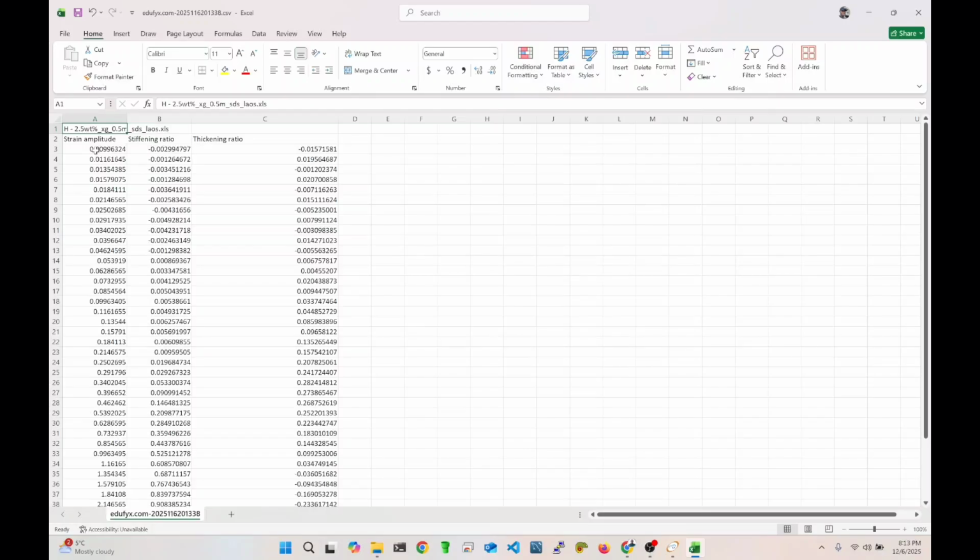So stress filtering is good in the smaller strain, in the smaller amplitude oscillatory shear regime, the SAOS regime, when the strain amplitude is small. But when the strain amplitude is large, stress filtering might result in loss of some data. So what you can do is to retain data within the small strain amplitude. So this is 0.009 or essentially 0.01.